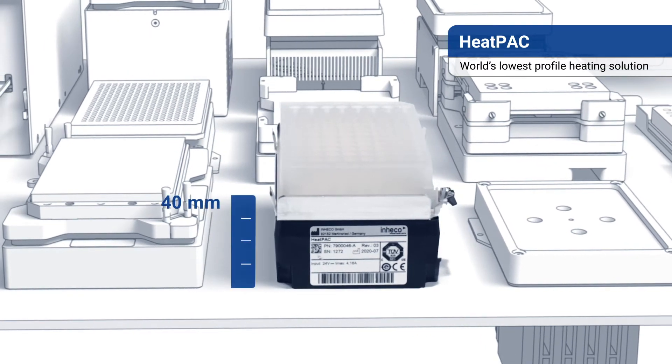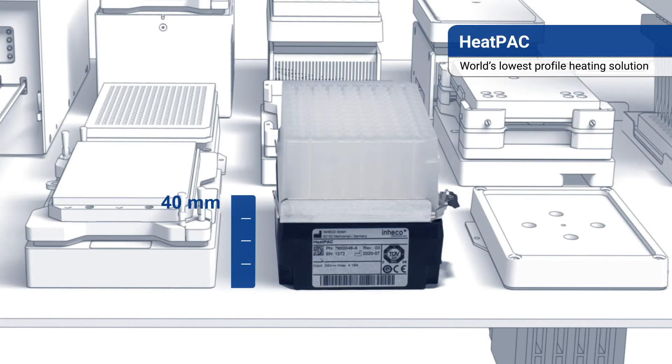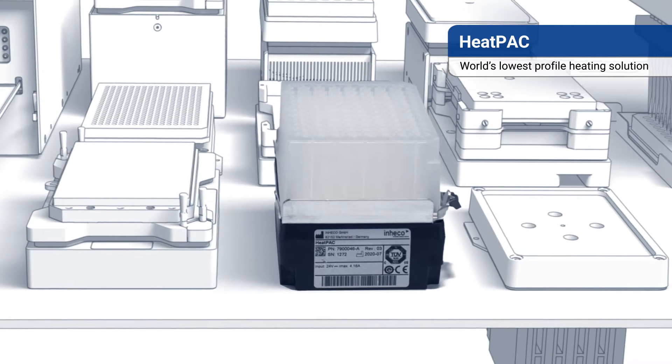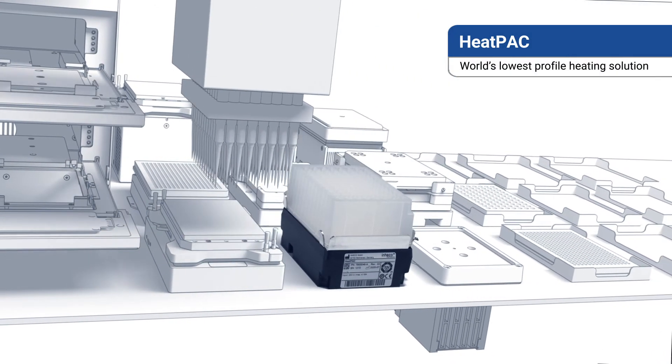The world's lowest profile of only 40mm — 30% smaller than our closest competitor — allows you to use deep well plates or disposables with an even higher profile when space is limited between the pipetting head and the deck.